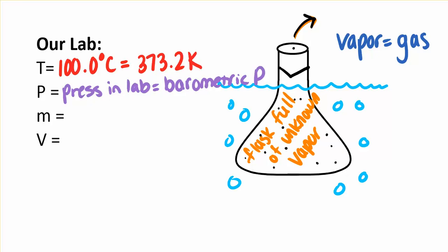Anyway, next we've got the mass. We need to know what the mass is of that number of molecules. And when it's in the gas phase, it's not easy to get the mass. It's kind of like if you wanted to get your weight and you tried to take your weight while standing in a swimming pool, your weight would come out lower, because you're kind of buoyant.